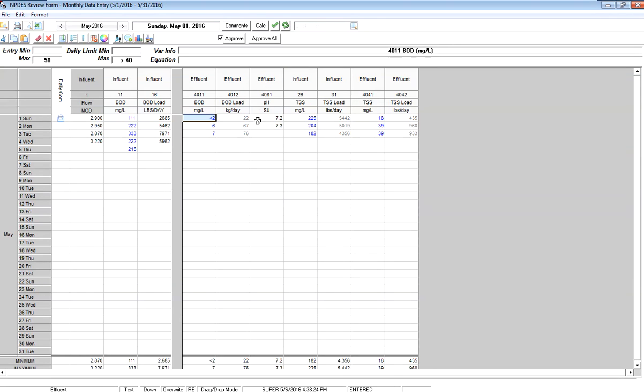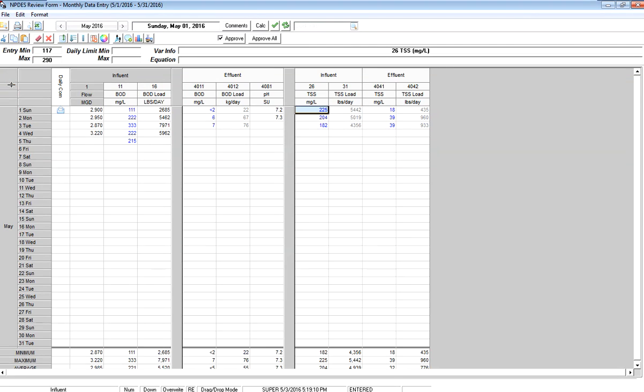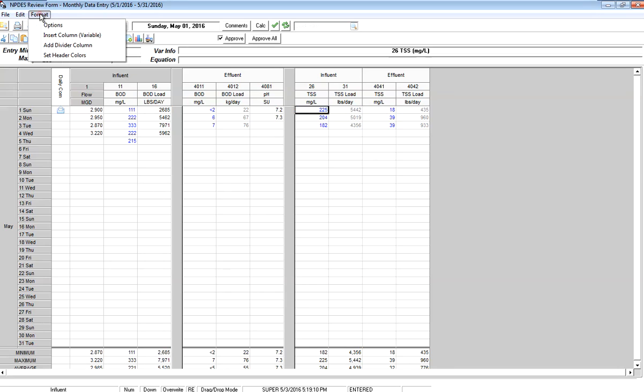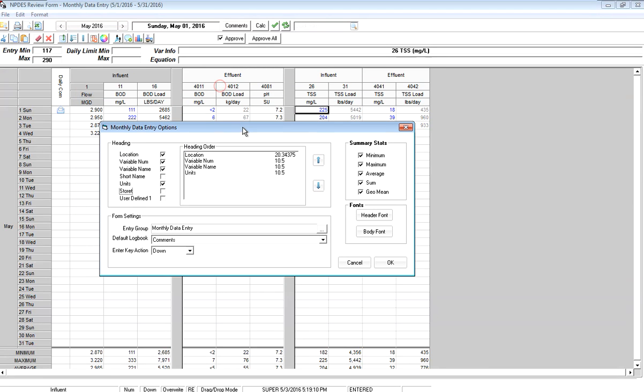Now I may want to insert a divider here also to make it look a little better. I can rearrange my header sizes by just dragging and dropping the column headers. If I want to change what's shown in the headers, I'm going to go to format and options. Here it says this is what's displayed: the location, the variable number, the name, and the units. I can add my store code into this.